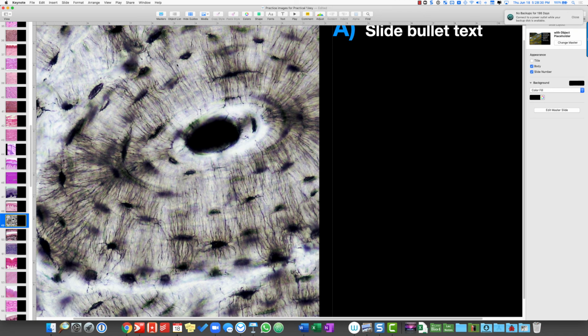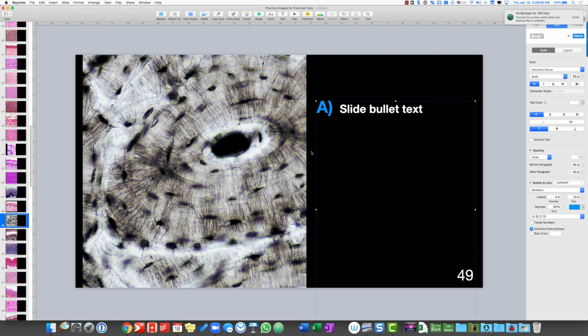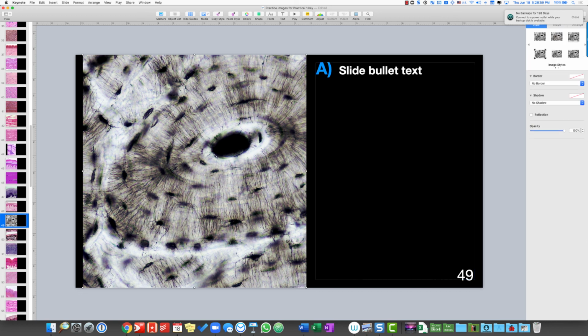Okay, as we'll learn in lecture 4, these osteocytes, they kind of hold hands. Well, they don't really hold hands, but they're associated in these rings. These rings are known as lamella. And then these concentric rings of the lamella, along with the osteocytes in lacunae, together they form a structure called the osteon. Osteon, also known as the Haversian system. And then at the center of that, there's a canal called the central canal, and also called the Haversian canal.